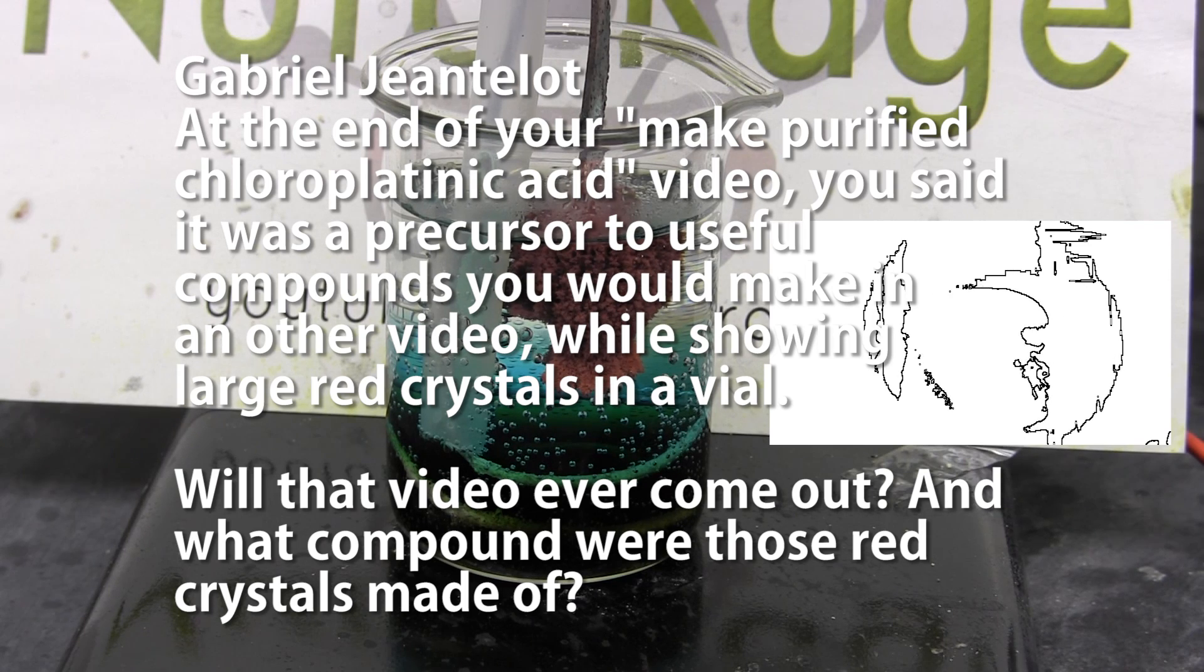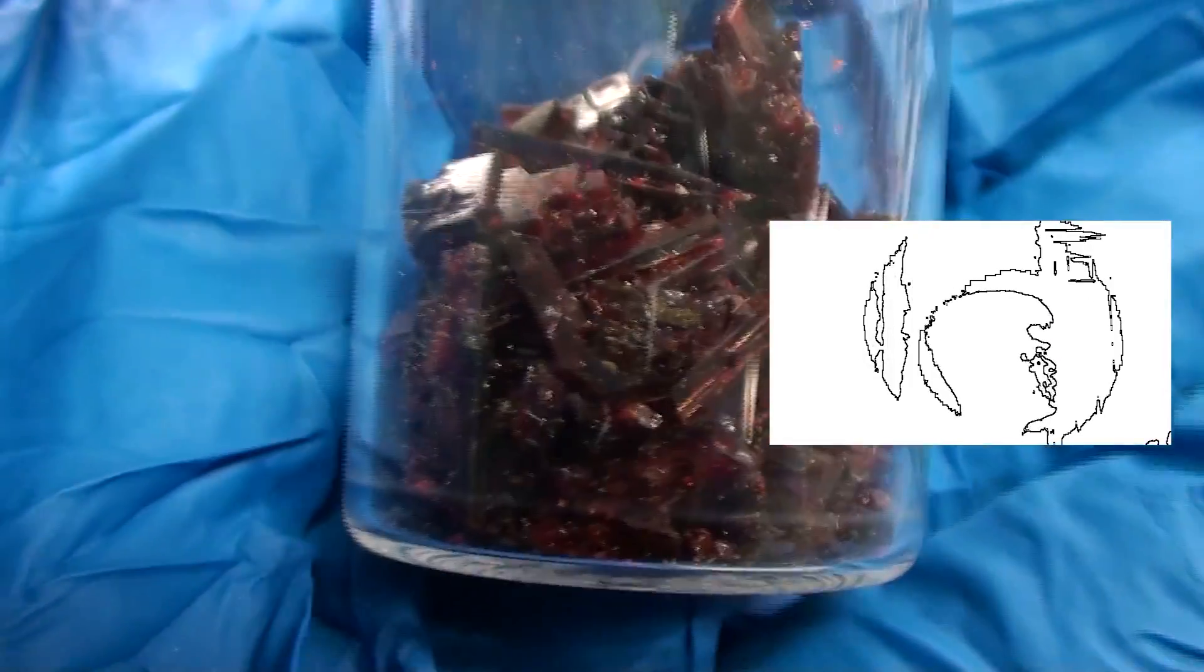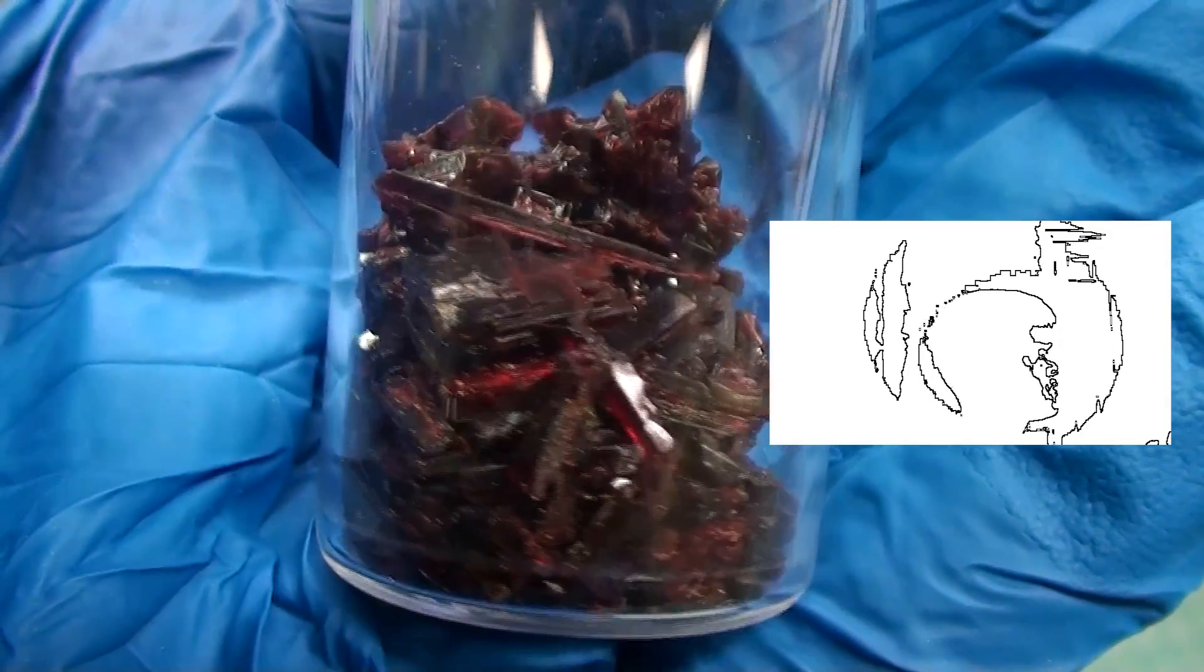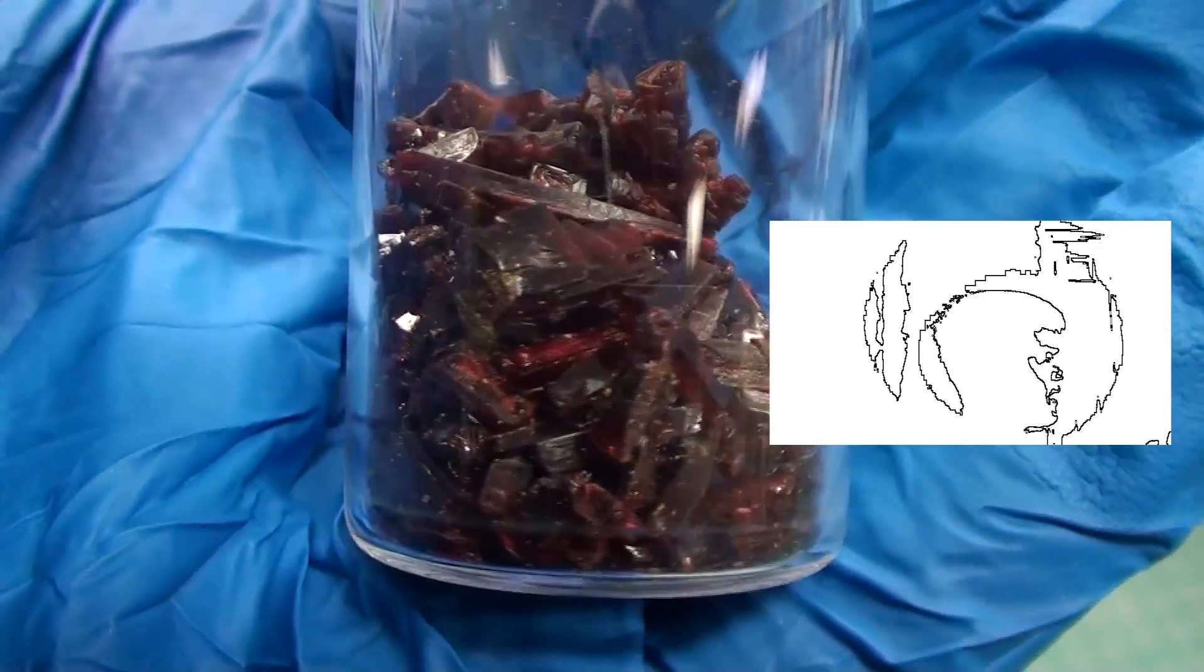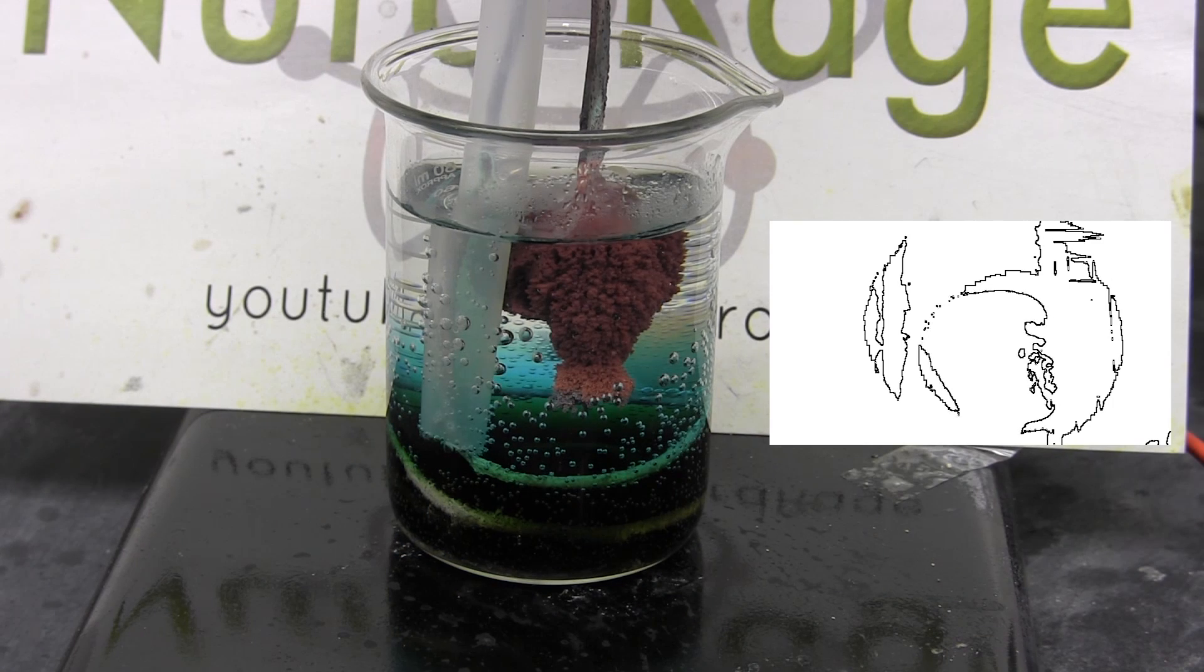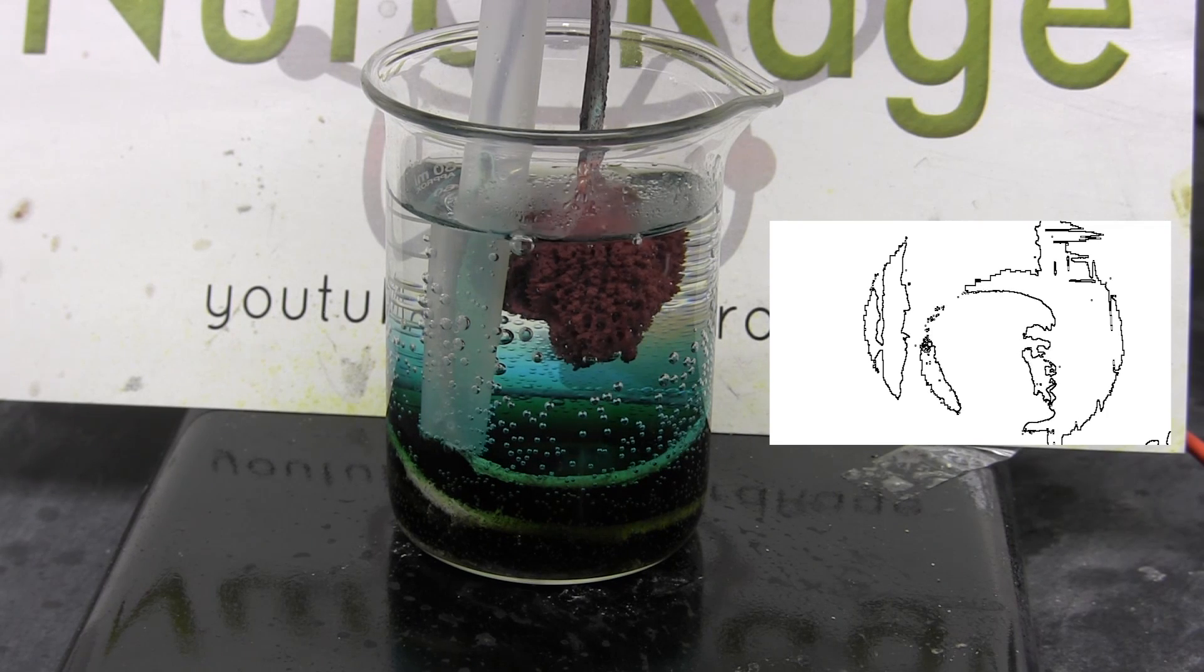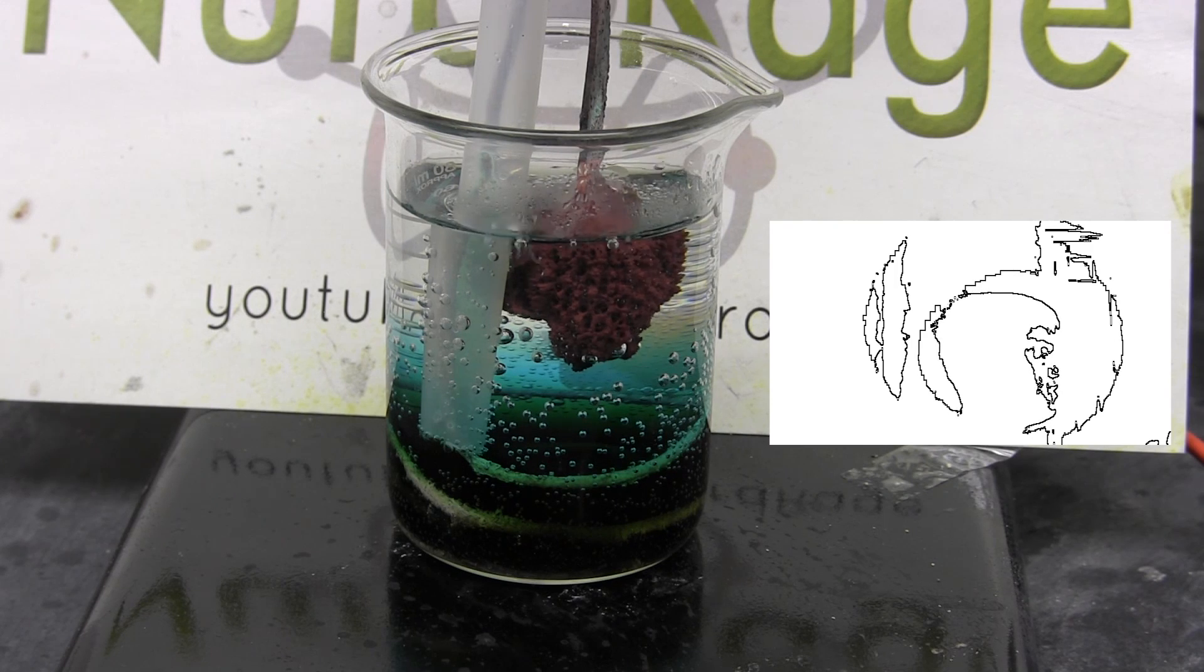Okay, so you're probably referring to this image I showed. Those beautiful red crystals are potassium tetrachloroplatinate. While I did film the process of making them, the problem was the film sucked. Bad camera angles, a very clicky procedure, and excessive on the fly changes to the procedure made for a video that was downright awful to watch. I wanted to redo the procedure but the platinum compounds had been earmarked for other uses so I put the video on hold.